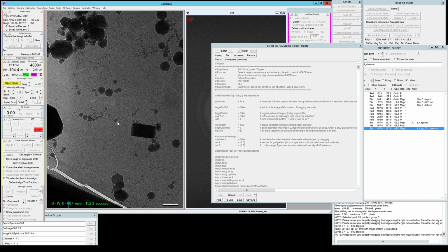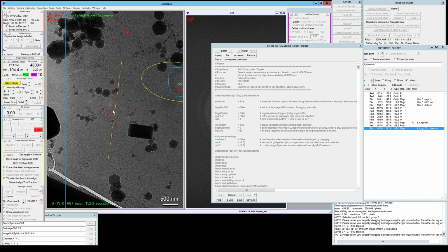I am interested in this vesicle here. So this is not always precise as you saw, it's a bit off. That's why you have to drag and refine it. We hit B. We do want to take a preview image. If you hit no when it asks you to take a preview image, it will take another view image and give you another chance to drag.